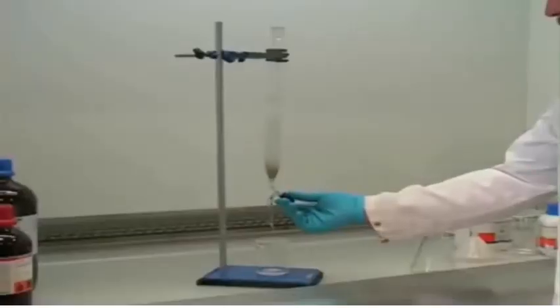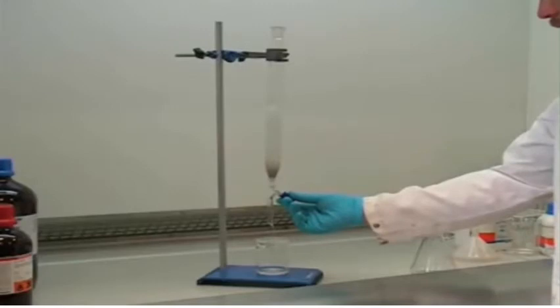It's crucial that you don't allow the silica to run dry, so you need to keep a close eye on the level of the eluent and close the tap at the appropriate moment.